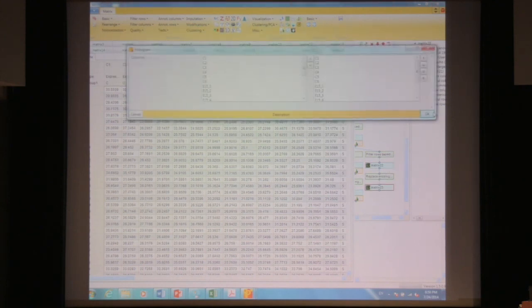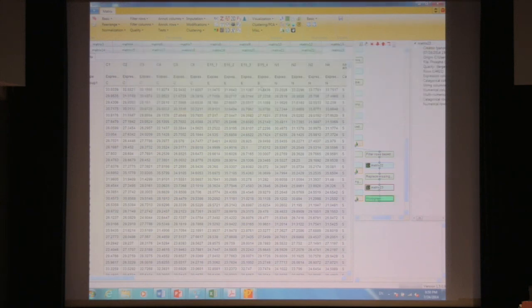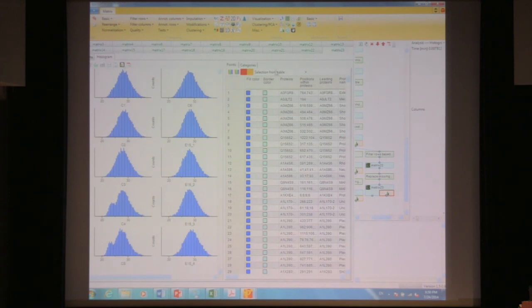So I've just imputed and plotted a histogram. And as Marco was saying, we want this imputed population to be ideally part of the same distribution, only downshifted. And that's what you can see here. Only there are much fewer imputed values. So you can see that this might be useful to convince you that we haven't shifted it entirely away from the existing distribution.